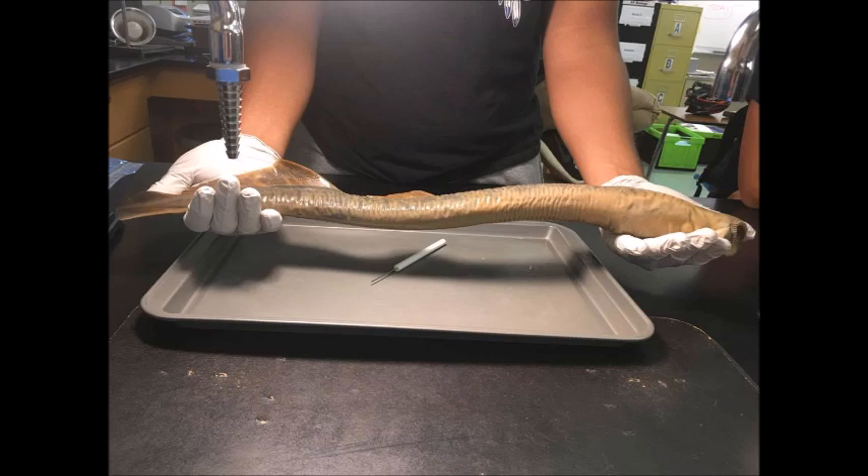Lampreys are a species of primitive fish-like jawless vertebrates. They live in coastal and fresh waters and are found in temperate regions around the world. The eel-like, scaleless animals range from about 15 to 100 cm long.